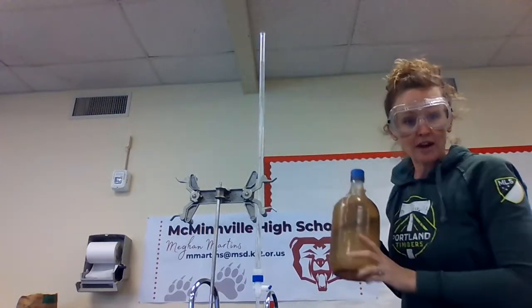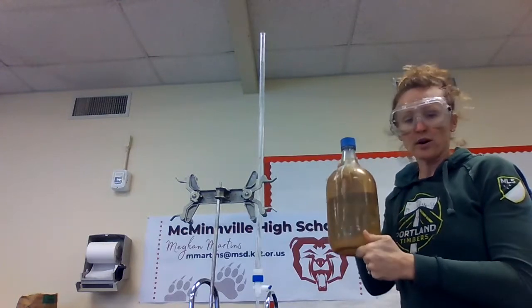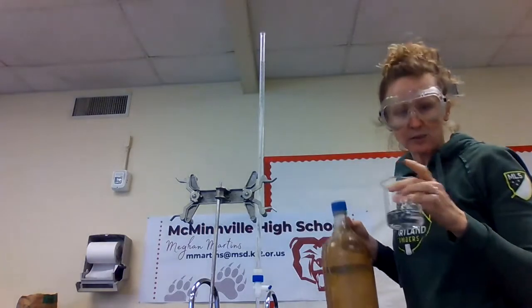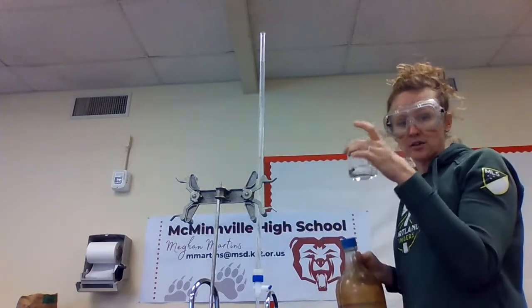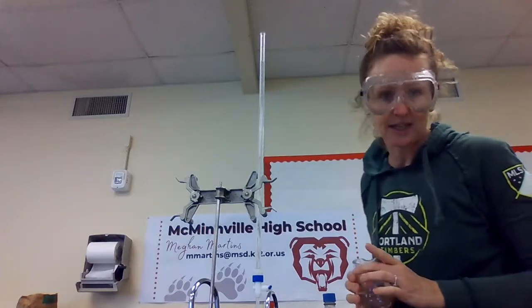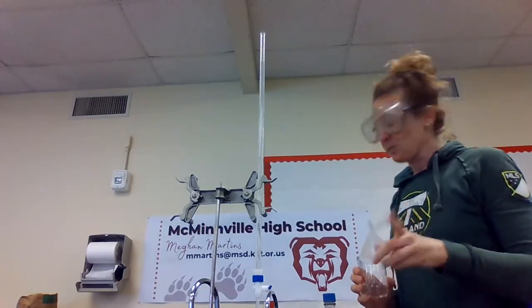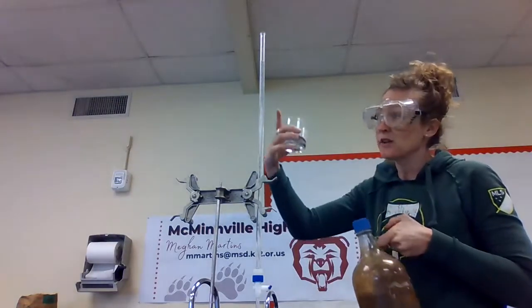No, don't ever do that. Whenever you are pouring from a giant jug, here is a technique tip. You always pour into another container first, and then you use that smaller container to pour into your burette. That's called pouring technique, and it sounds very simple, but you would be surprised how many students pour directly from a shady looking jug into a very small tube.